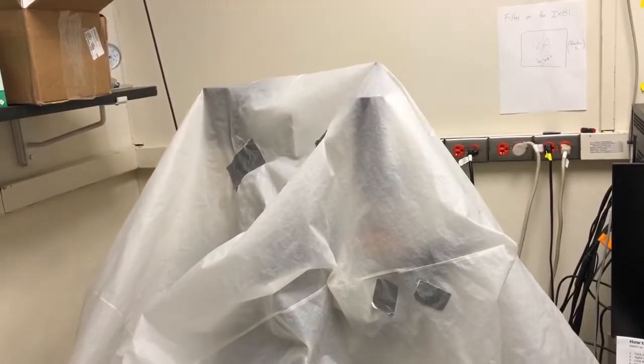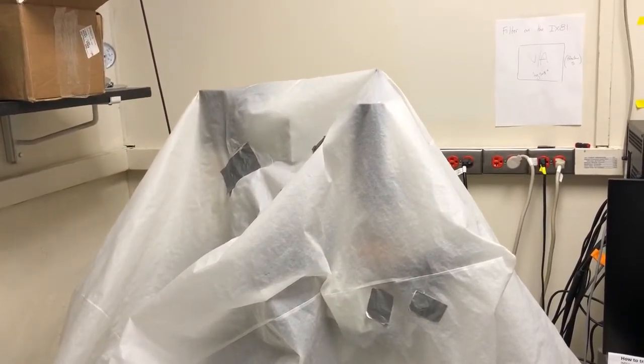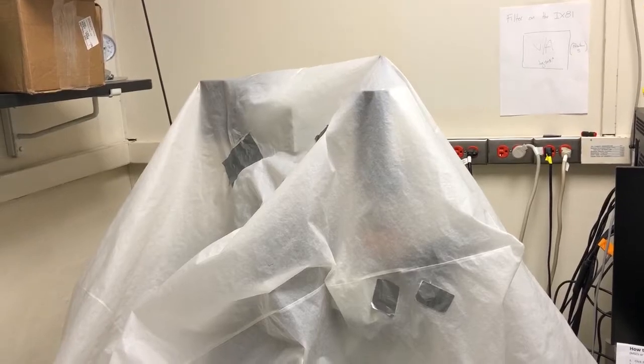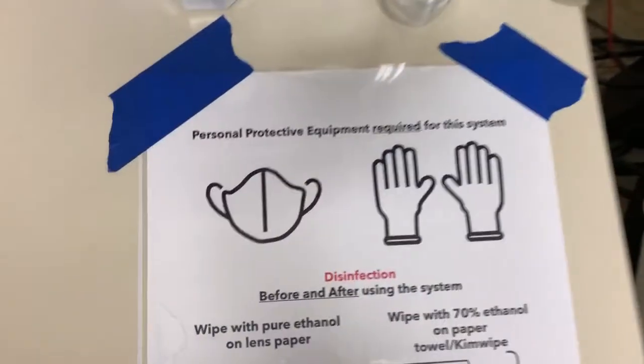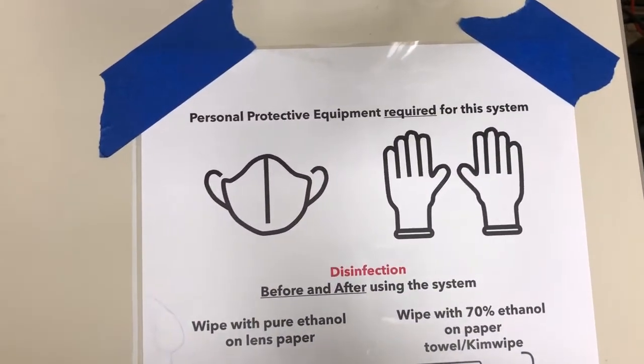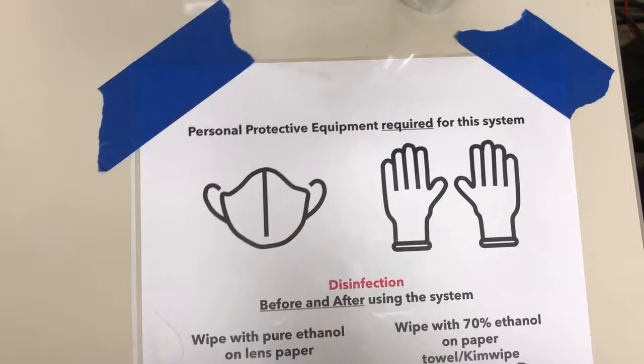Hi, this video is going to show you how to turn on the IX-81, or LUNA, microscope when you want to do fluorescence imaging. Before we can start, we need to make sure we have the proper personal protective equipment required for the system, which is a mask and gloves. So here are my gloves. I have my mask on.